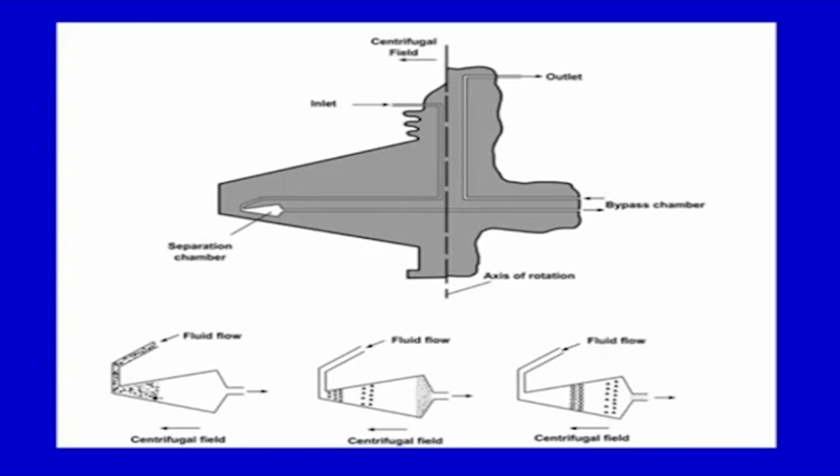You can see here these three figures. Fluid is flowing in here, and as it flows in, there will be separation of the particles, and larger particles will be on this side and smaller particles on the other side, and as it goes on they will finally be separated. Like I said, larger particles accumulate towards the centrifugal end where the liquid flow velocity is high, and the smaller particles will be towards where the velocity is low.